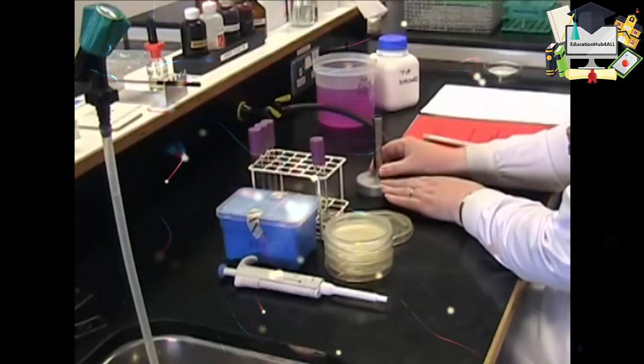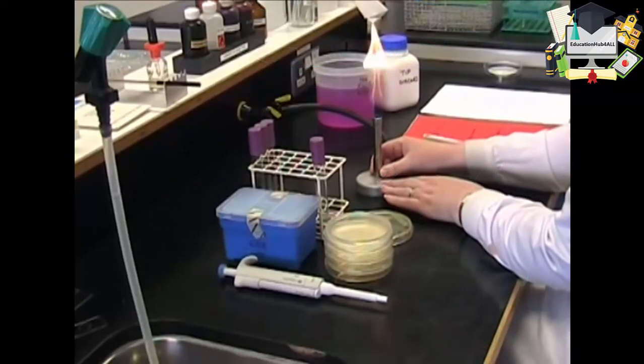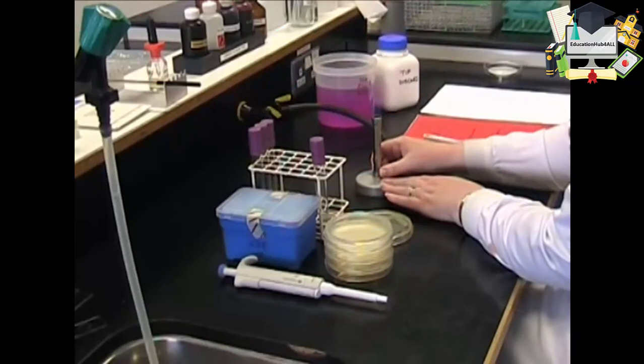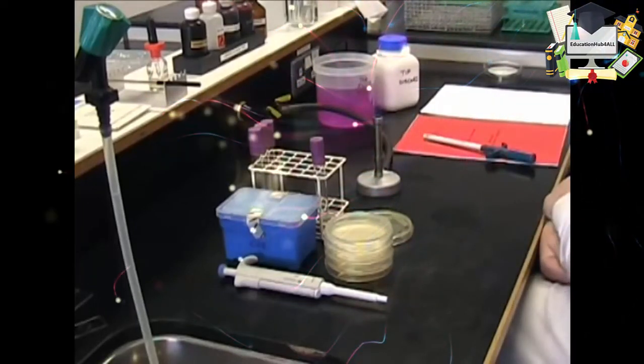When you're not using your Bunsen, close the air hole and leave it on a nice yellow flame. When it's in use, we open the air hole and have a nice blue cone.